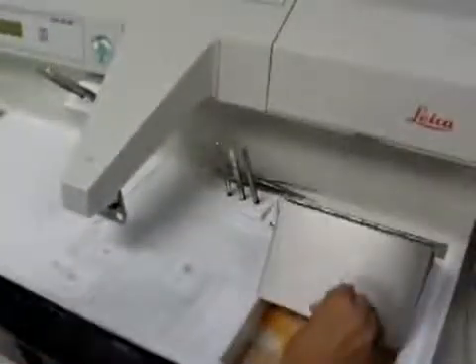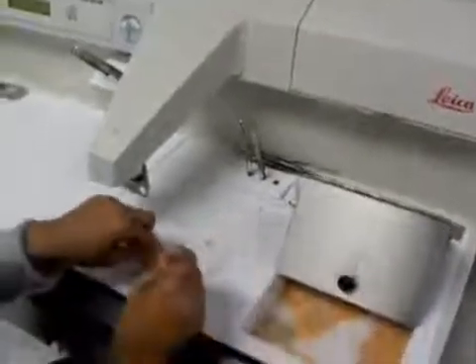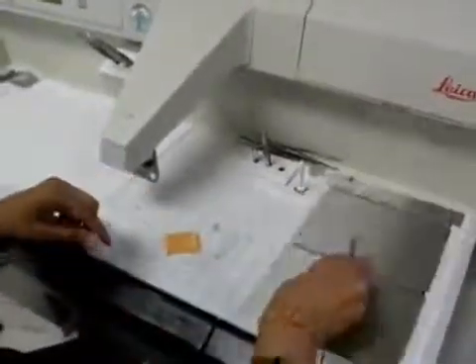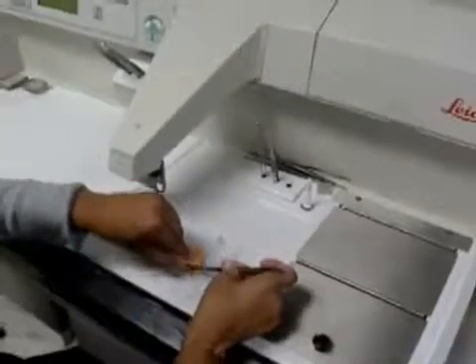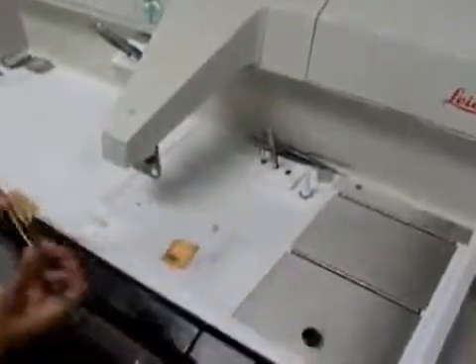You take the cassette out and open it with your forceps gently to find the tissue. Make sure you check your lid so that no tissue is on there. Then you will pick out the proper mold size for the size of the tissue.